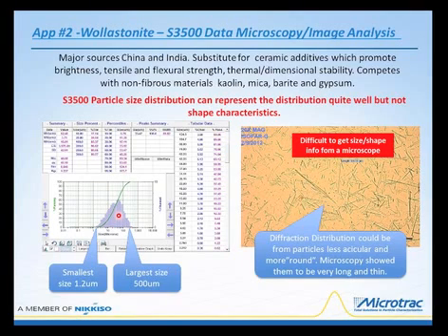So the first thing one would do is take a look at this on a microscope and say, holy cow, we've got some very, very long particles that may have now been broken up, and that has caused the particle size distribution from the Microtrac to change.